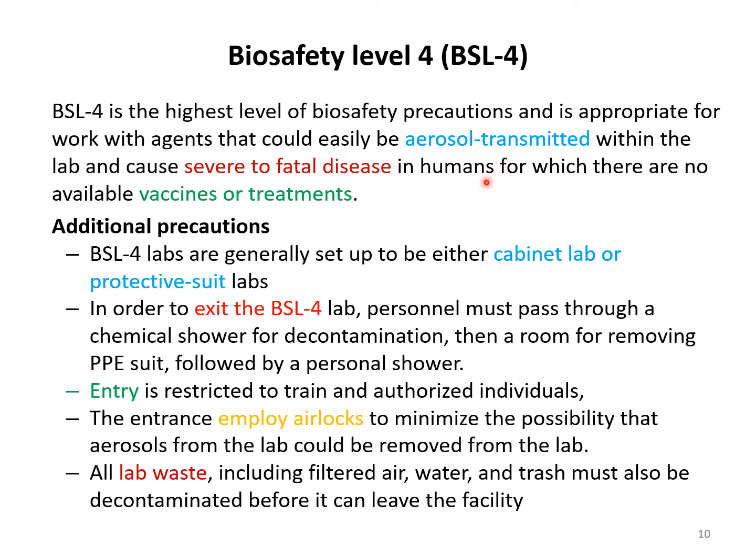So mostly the pathogens that are more severe, or newly emerged, or novel biopathogens fall under biosafety level 4. Additional precautions include BSL-1, BSL-2, BSL-3 plus these additional precautions: we need a cabinet lab or protective suit labs. They are very sophisticated labs.